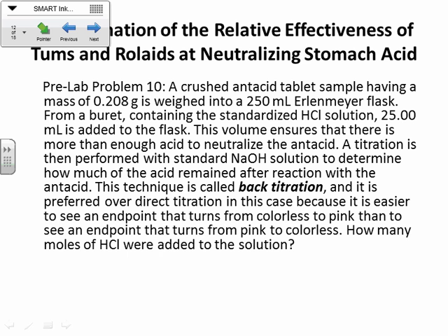Okay? Now the idea here is the antacid tablet is a base. All right, so you're going to add an acid to it to neutralize the antacid or the base. Okay. Once you've added that HCl, and you've added plenty so that the antacid is completely neutralized, then you're going to do what's called a back. I'm telling you what you're going to do. This is just what happened for the pre-lab. This is just a hypothetical situation here. Sorry, I'm not telling you what to do. That's not the point of this.